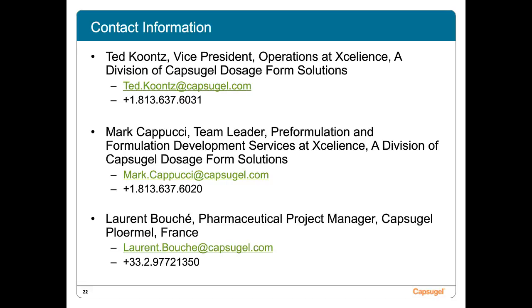So that's a consideration, the dose weight, and then the flow of the powder is another one. If you've got a powder that doesn't flow well and the dose is high, it may require some manual manipulation of the powder, which takes a little bit longer. But those are two aspects. And then how many capsules can we produce in a day?